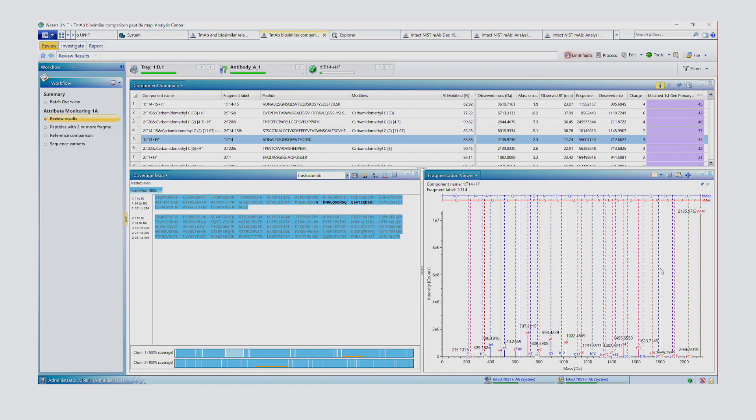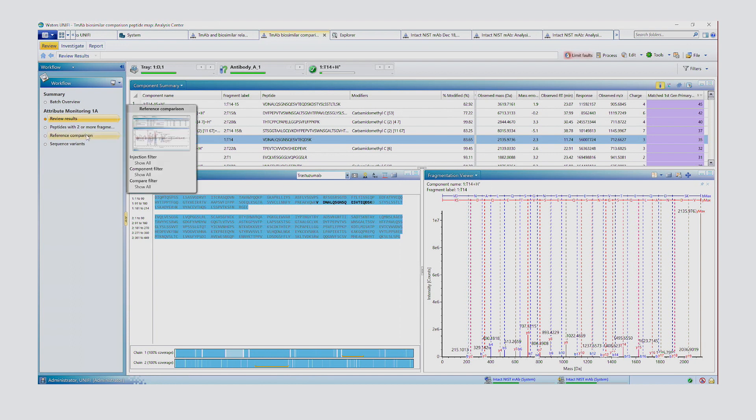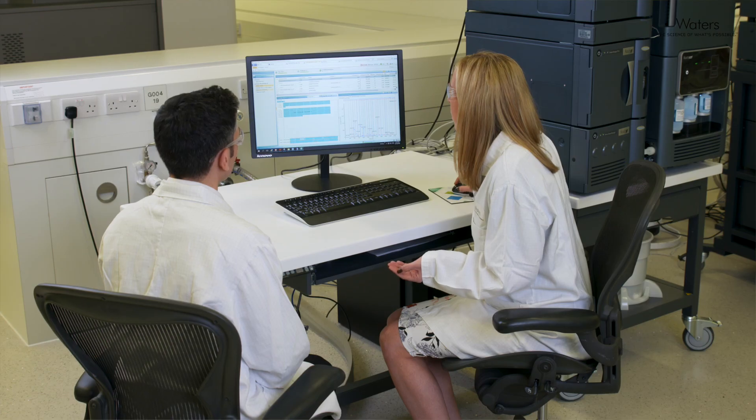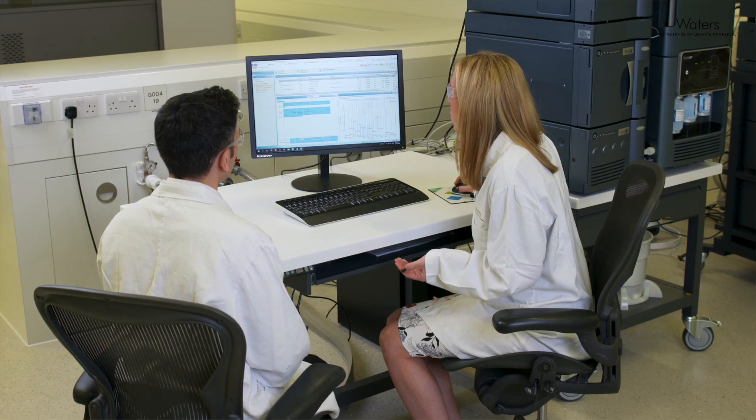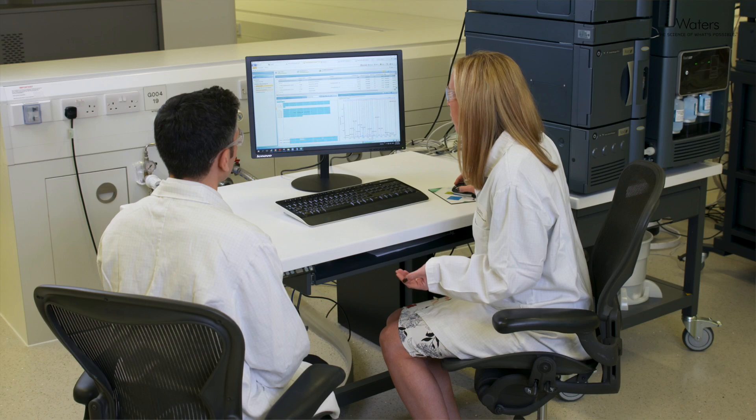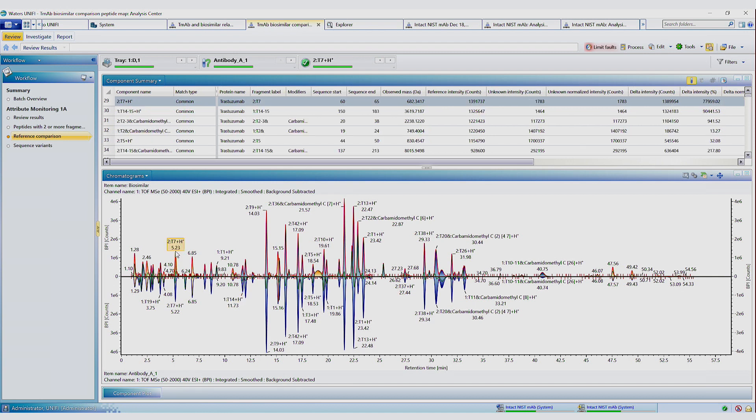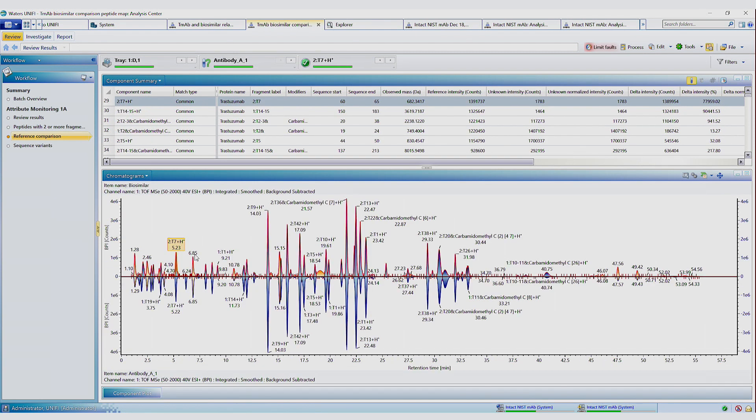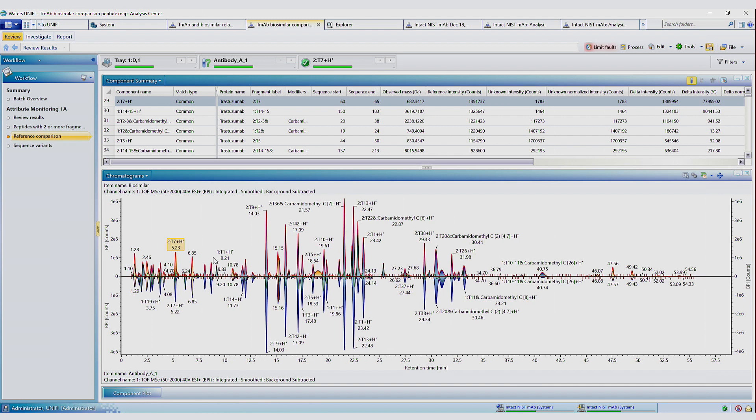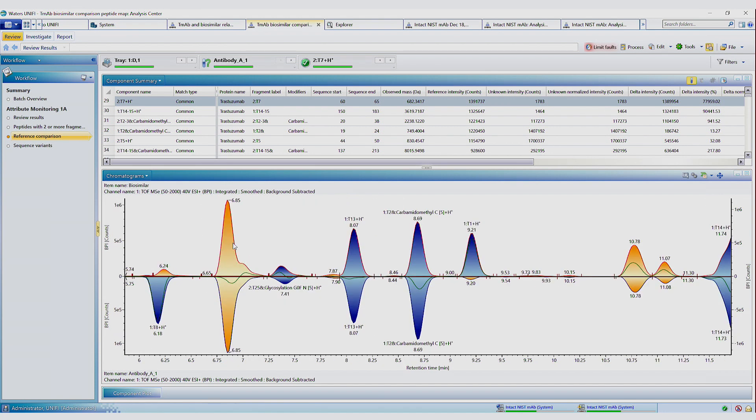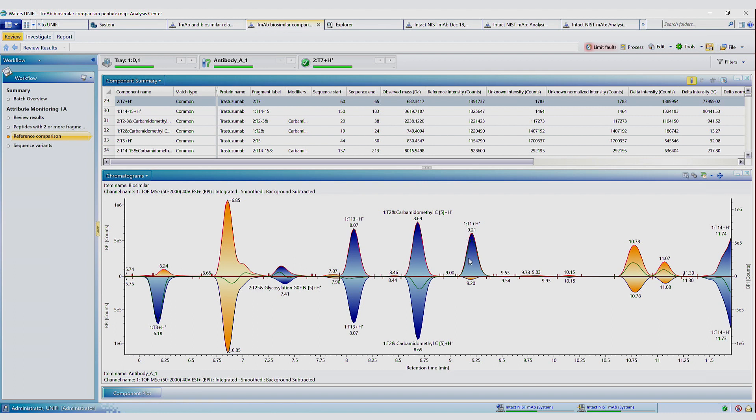So for example, if we wanted to look at a particular peptide monitor, we could choose that by doing a reference comparison. So here we have a comparison between trastuzumab and a biosimilar version of trastuzumab. So if we zoom into a particular area of interest on the chromatogram, we can see that around nine minutes, we have a peak that's present in the biosimilar trastuzumab that's not present in the reference trastuzumab.